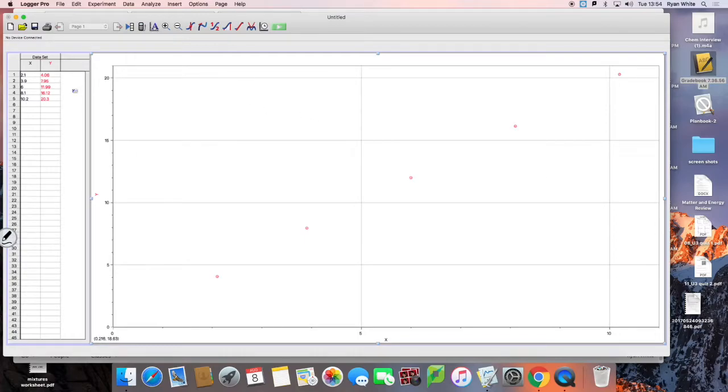I put some data in here. This is the data that I took from the density lab experiment.